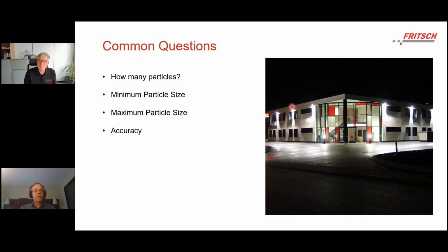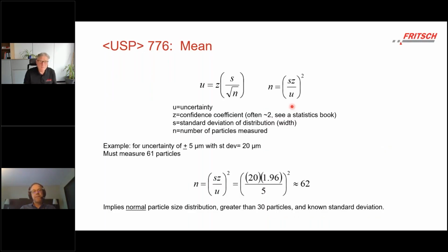There are kind of common questions. How many particles, minimum particle size, maximum particle size, and accuracy. I think I addressed the last one with the standard. And then I'm going to talk a little bit about how many particles, because that gets complicated.